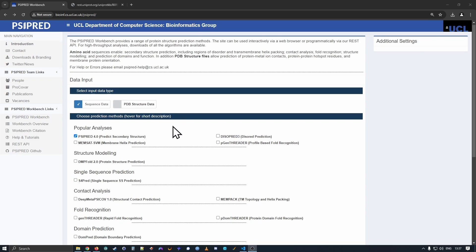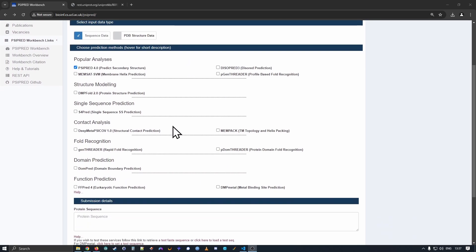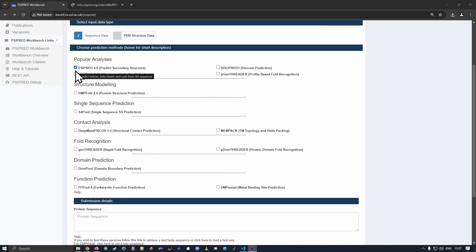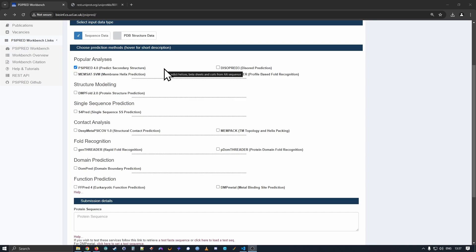For now, however, the important first area of the page is where we can select different predictive methods for protein sequences. When you arrive at the page, the CyberEd method is already pre-selected. This is the most popular method that our users use, and so we have that pre-selected.